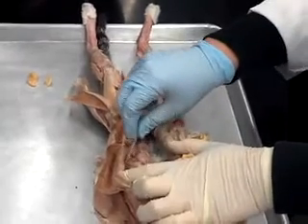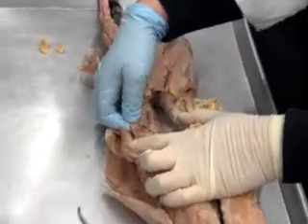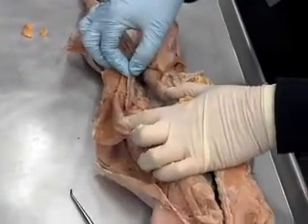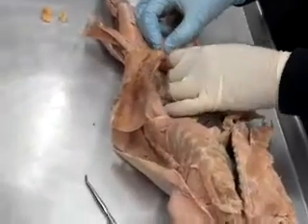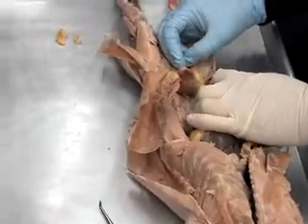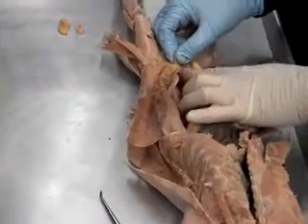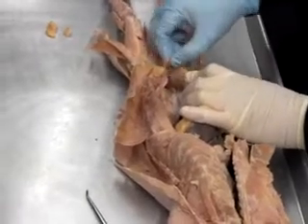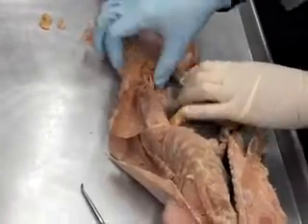For females, you'll have to use a little imagination. Female cats are a little bit different. This is their ovary right here. This is their uterine tube. And, of course, it goes into the uterus, which you can't see unless she was pregnant. Then you could see the uterus. This is the urinary bladder, not the uterus.